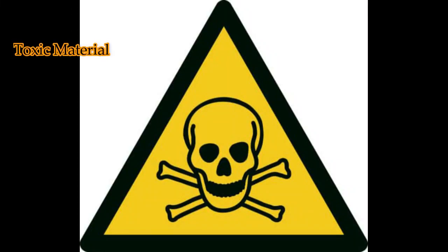Toxic material. You will find this sign in areas where substances are held that could prove harmful to humans if they are inhaled, ingested, or they come into contact with the skin. Stay safe. The effects of such substances coming into contact with human tissue can vary depending on the material and its concentrations, so masks, goggles, and gloves should all be used when in the presence of toxic material.